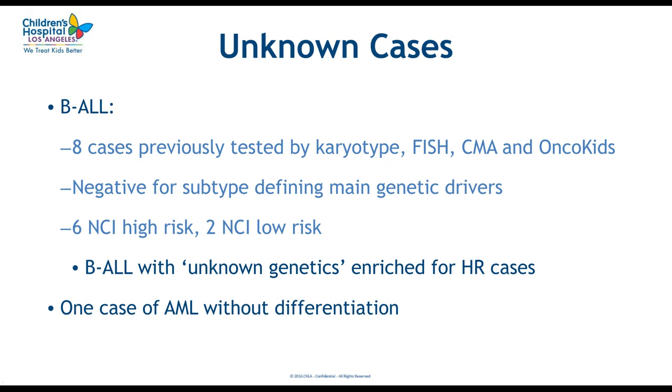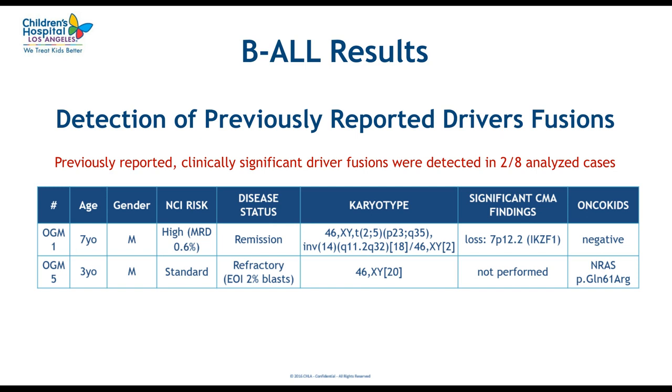And I think that stresses the importance of having good and more efficient methods to tackle these very difficult cases that remained unknown, since those are the high-risk ones where you, from diagnosis, want to know as much information as possible and choose the right approach. So I will dive immediately into our results with optical genome mapping.